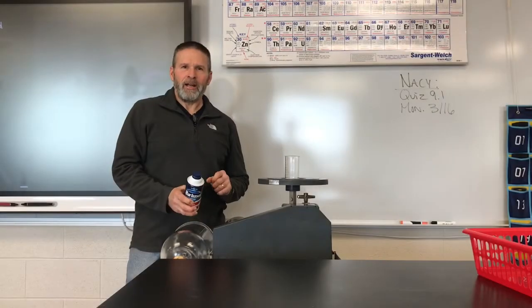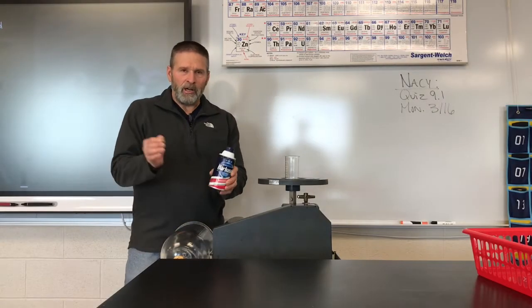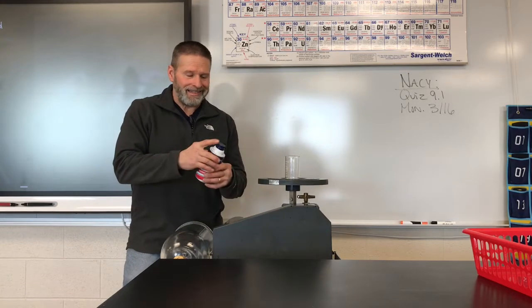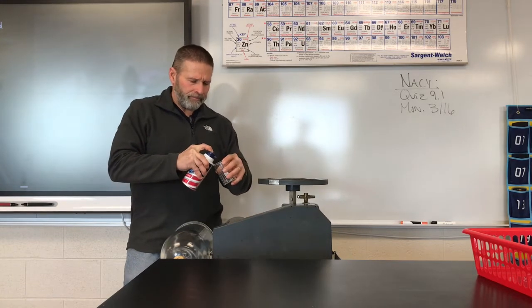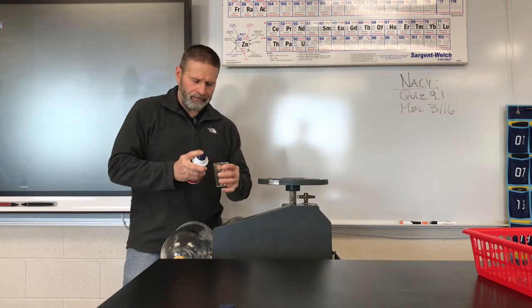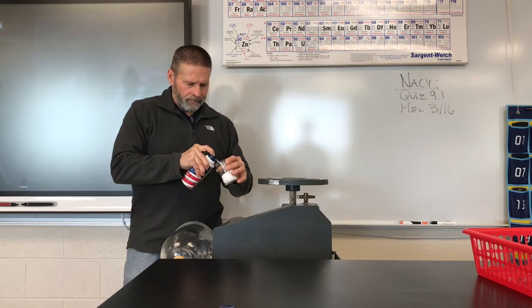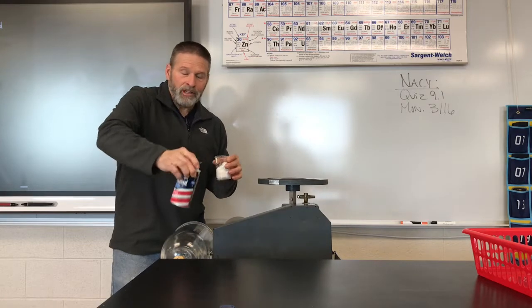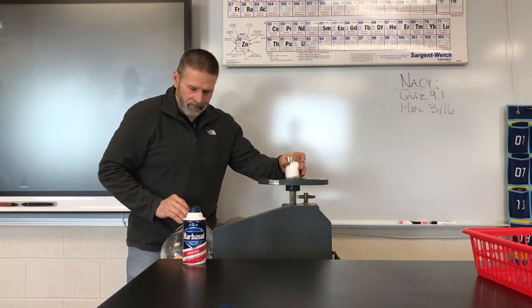All right, Chem Nation, here comes vacuum pump demo number three. We're going to put some shaving cream inside the vacuum pump. Helps when you take the cap off. I am not endorsing Barbasol, by the way. It's just cheap.